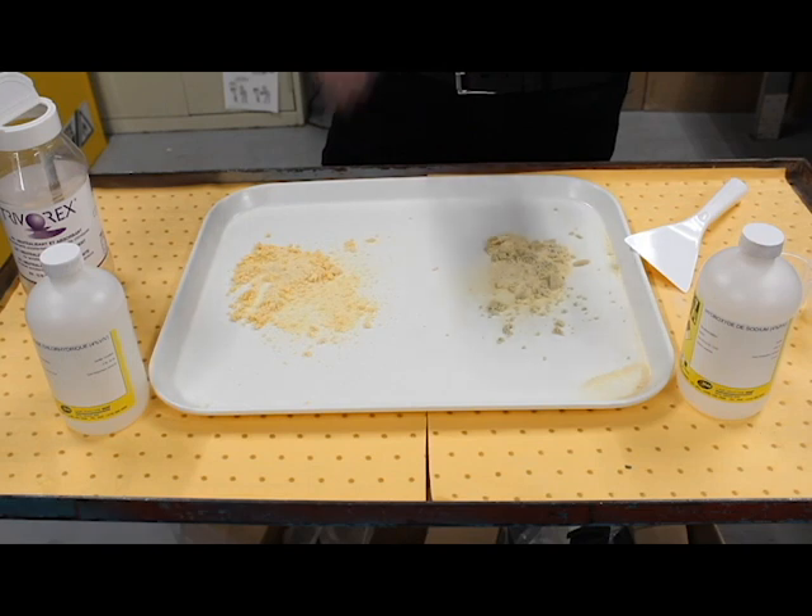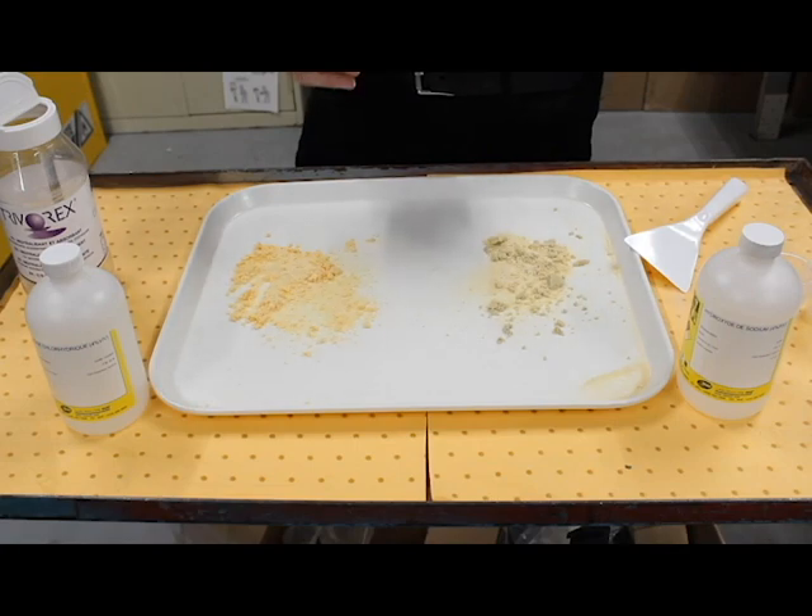Perfectly safe to use, suppresses the vapor rapidly, keeps the surface dry, and declassifies from a hazard to a non-hazard very quickly. Well, that was awesome — thank you so much for that great demonstration. I know I learned a ton. You're very welcome.